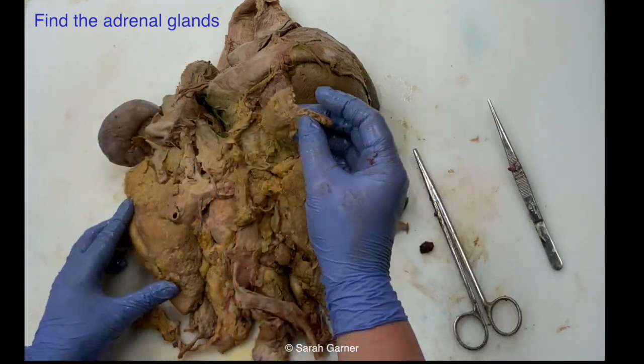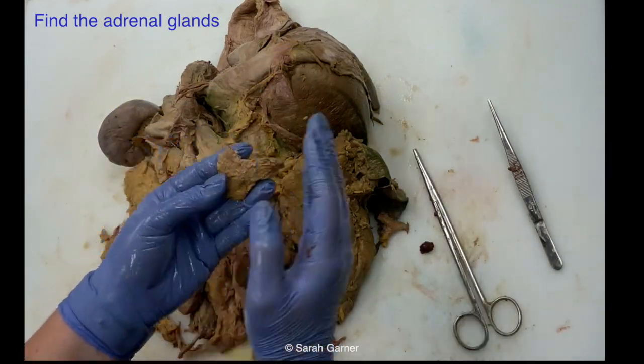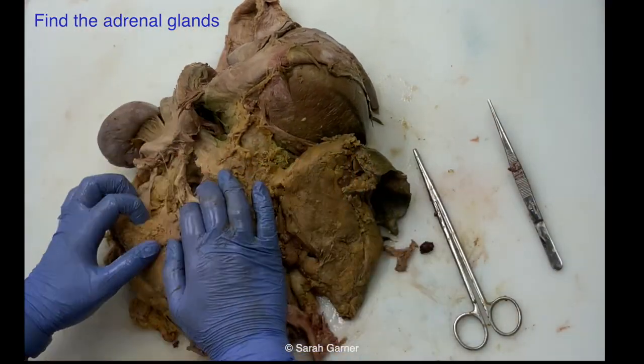So weigh it, sit it aside, and then once you get all your organs separated, you can section through it. So we'll just sit that to the side there. So that was our right side. Now let's find our left side.